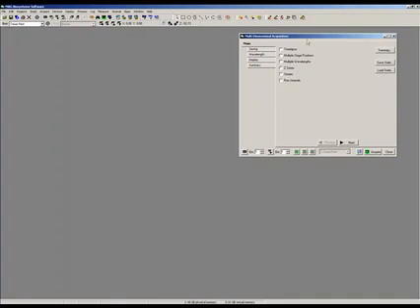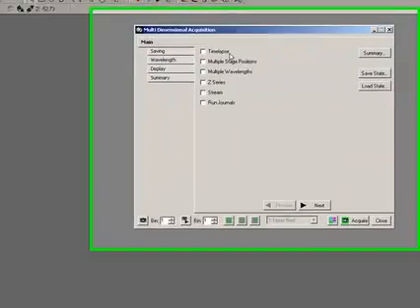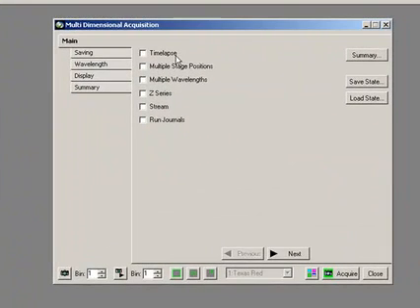If we look at the main tab here, I've got options to control timelapse, stage positions, multiple wavelengths, Z series, to perform streaming operations, and to run journals at specific points.